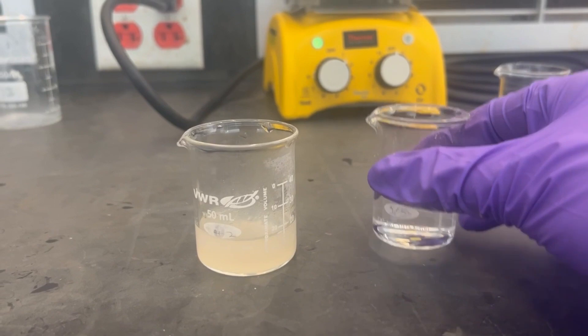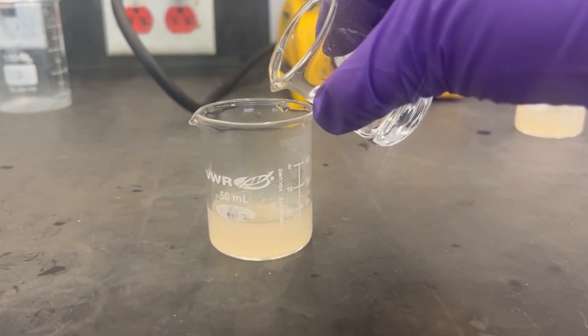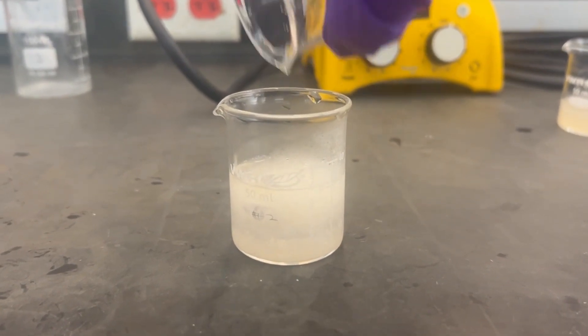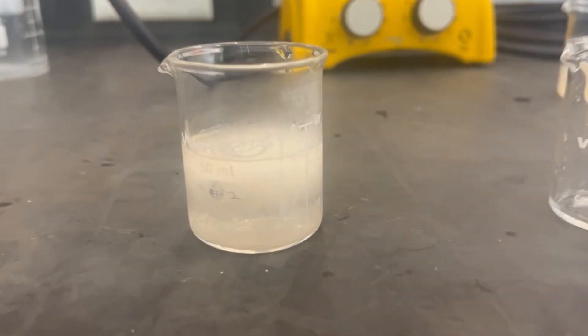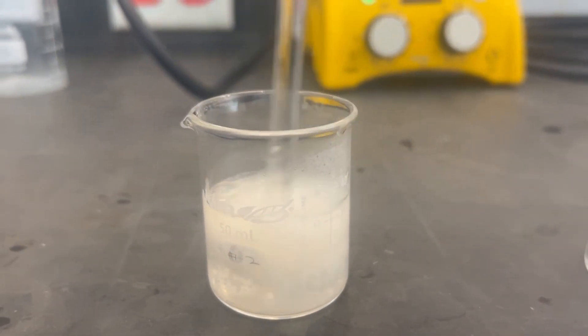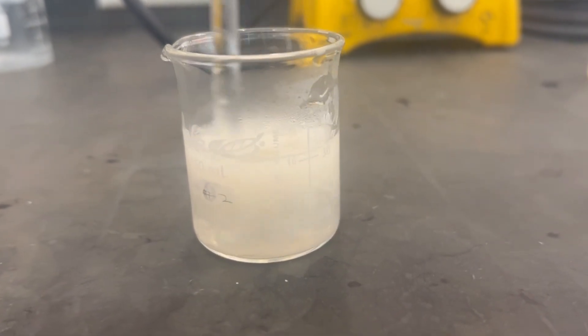To prepare the sodium soap for Part C, add 15 milliliters of saturated sodium chloride solution to one of the 50 milliliter beakers earlier. Stir the solution until a solid appears and floats at the surface of the solution. This solid is the sodium soap.